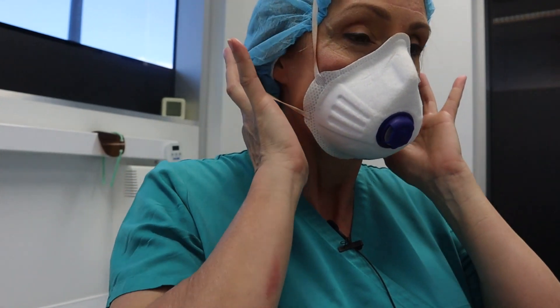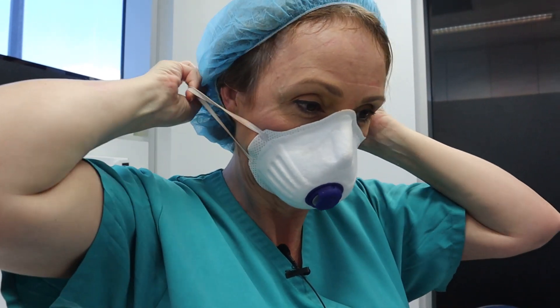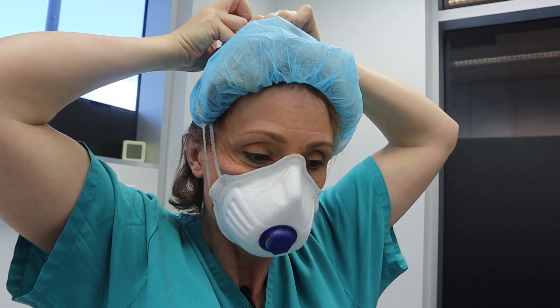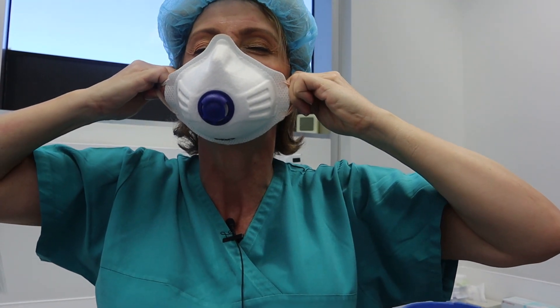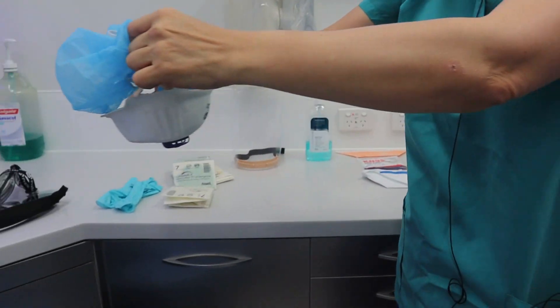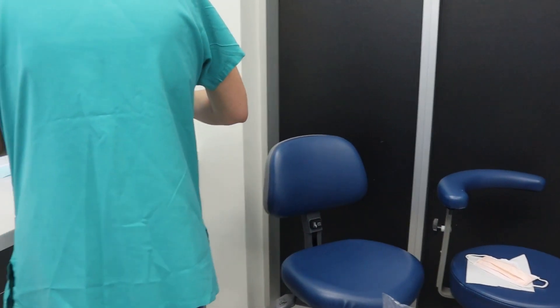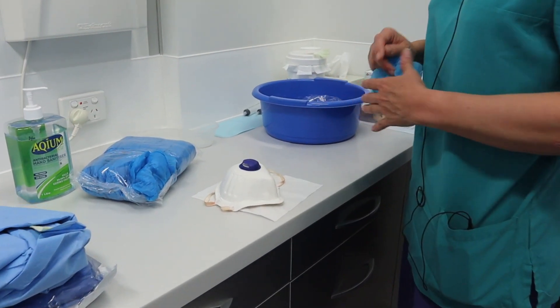The last thing I take off is the mask. It's really important that the mask does not touch my face because the outside is now completely contaminated. So I go to the side of the mask and bring both the top and bottom straps together so I can grab them with one hand. I lift it to the top — it looks like my hair will come off at the same time. I go down to the side, close my eyes, and take it off. This now goes to the bin. If it's reusable, I make sure the contaminated outside sits on a protective surface, because that top part needs to be disinfected.